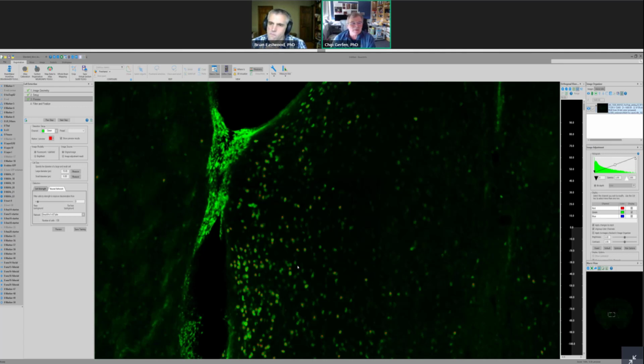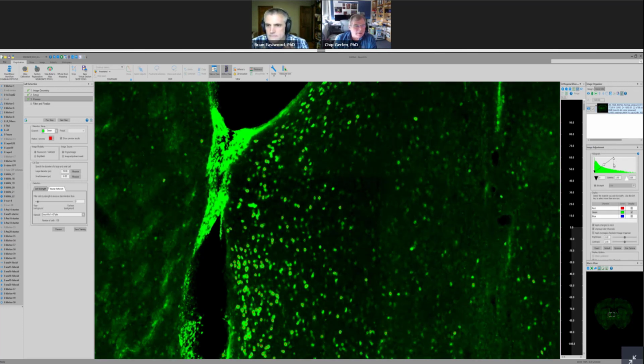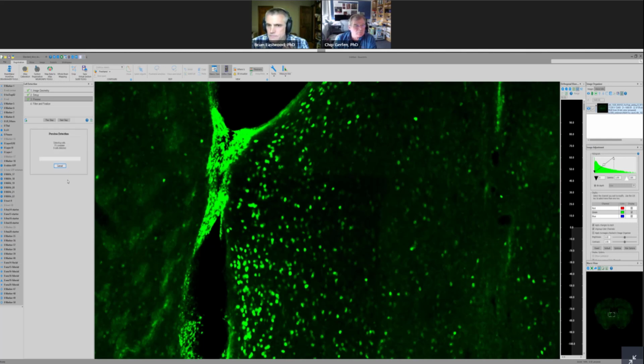An alternative way that we can do is to use this network and adjust. So this is the histogram of the FOSS labeled cells, and we're going to increase it quite a bit. And now there's the option of actually using the image adjustment result. It picked up many more neurons that had before had lower intensities. Now they have higher intensity. And yet it did not pick up many in the artifactual background labeling.